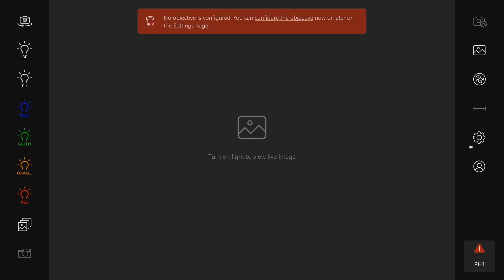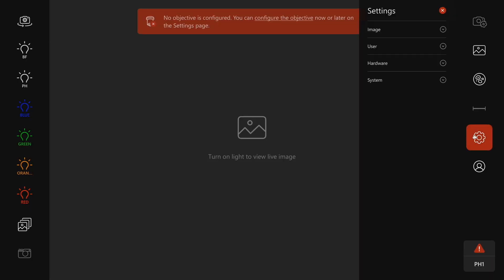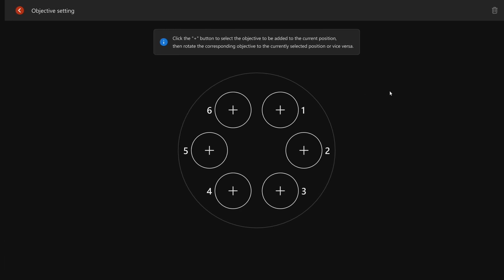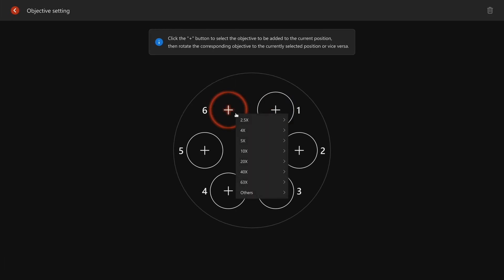To configure the objective in Mateo FL software, go to Settings, click on Hardware, and then Objective Setting. Select the physical position, numbered from 1 to 6 on the nose piece, and select the correct objective from the drop-down menu. Your objective is now configured correctly.